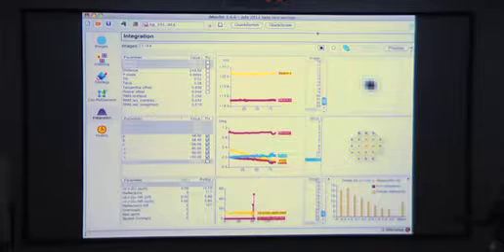And because of the post-refinement, all these are the parameters that are refined by post-refinement, because these parameters are using information from several images in the refinement, it may not be the first image that is associated with the discontinuity that's given rise to the problem.